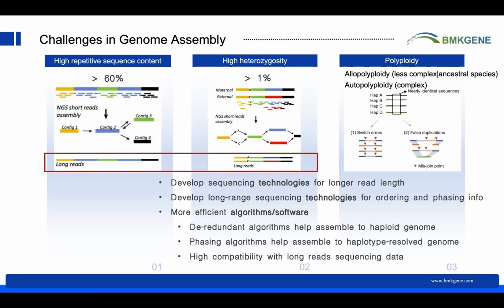Then we do the experiment, cutting and purification, to maintain a sequence that has half from the regions at this site and half from the regions at the interacting site. From the sequence we can know the spatial interactions between long-range sequences.